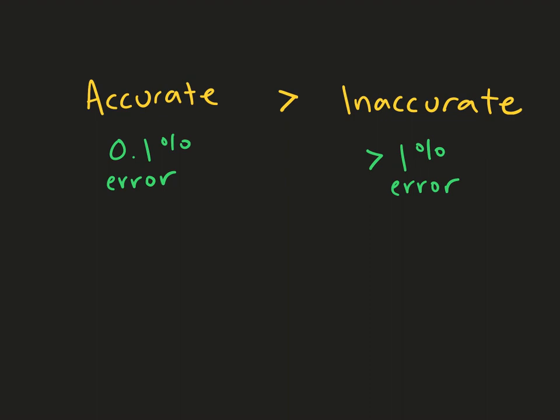Also, it's really important for this sequencing method to be accurate. What I'll call accurate is about a 0.1% error rate. This means that you're still going to be making a lot of mistakes when you think about the billions of base pairs that make up a genome. But so far, as of 2020, we're still seeing error rates about this much. There are other methods that are less accurate but still popular for some reasons we're going to explore in class. And by here, inaccurate, I'm going to say greater than about a 1% error rate.